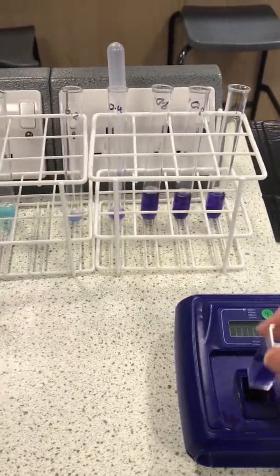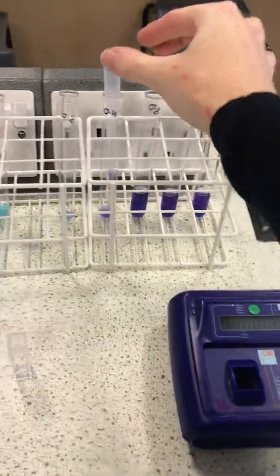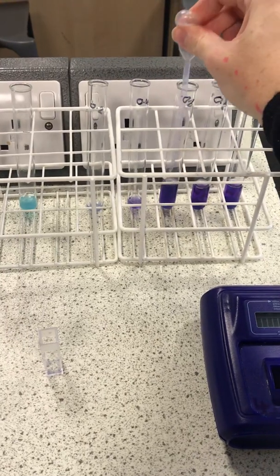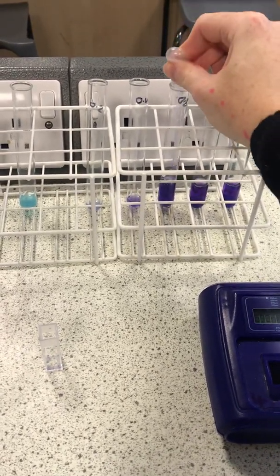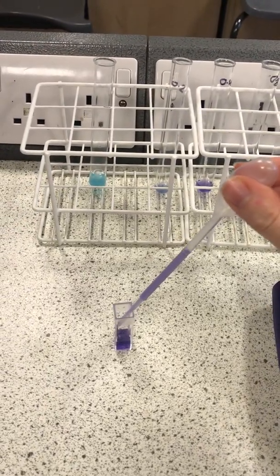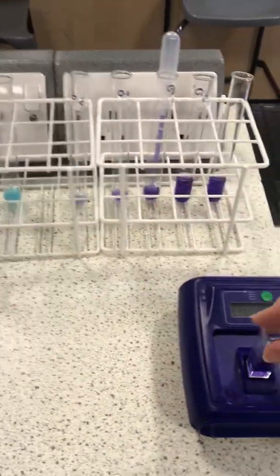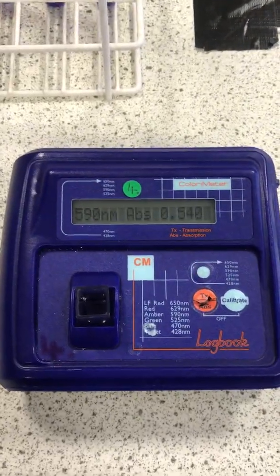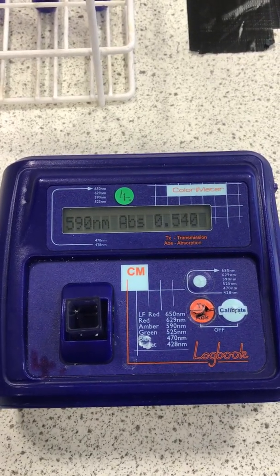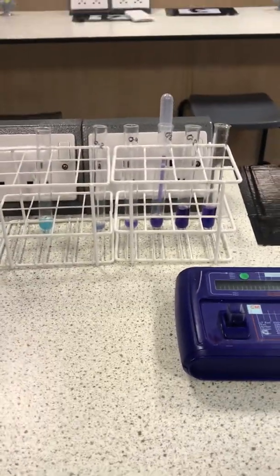Okay, we would then simply repeat that process with each of the different concentrations that we've prepared in advance, the known concentrations, recording the data down each time. And then we would have values of data that have been generated for known concentrations.